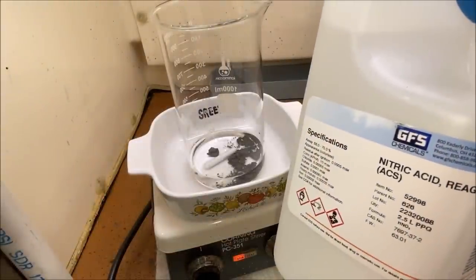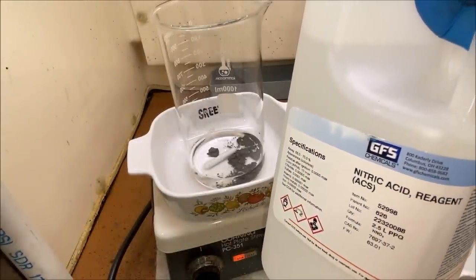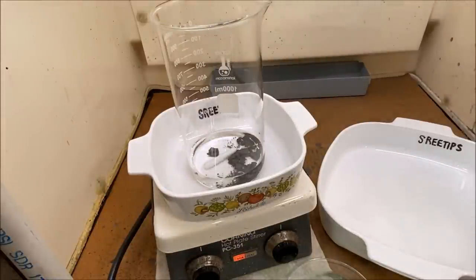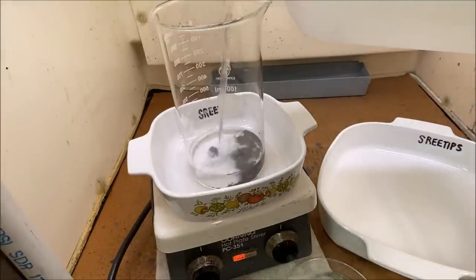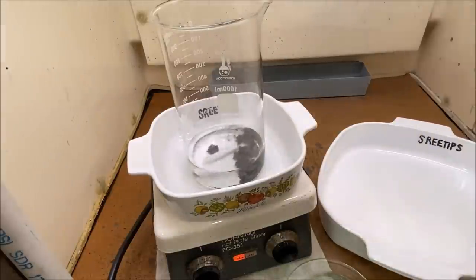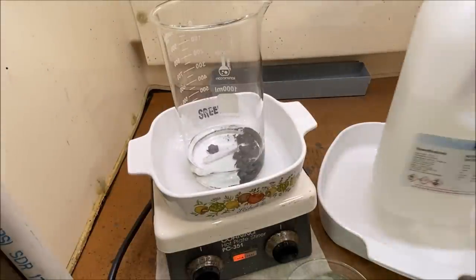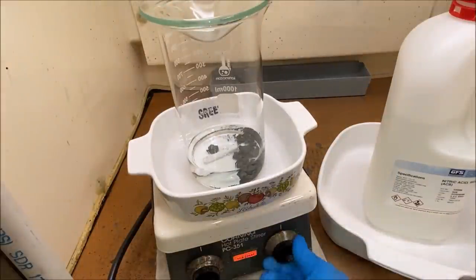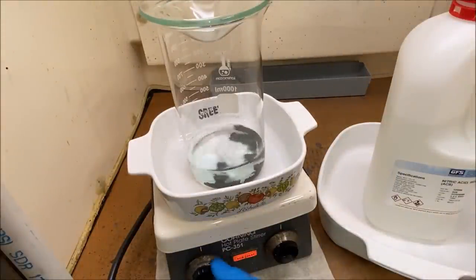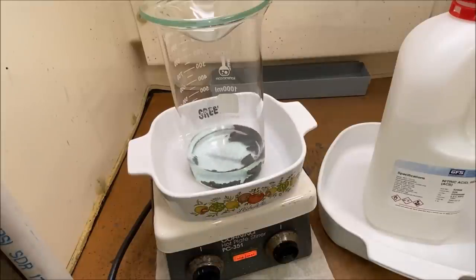I'm going to add a little bit of nitric acid now. Let's see if we can start pulling something out of these solids. That was about 50 milliliters of nitric acid. Cover this up. Add a little bit of heat. Our stir bar ain't working. There we go. And we'll start pulling whatever we can with nitric acid out of these solids.